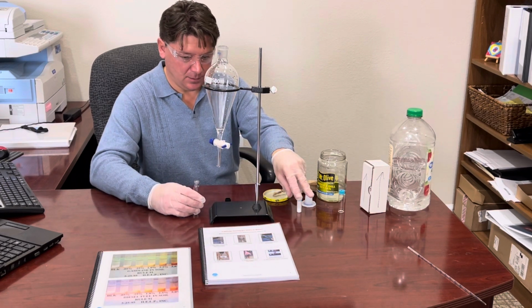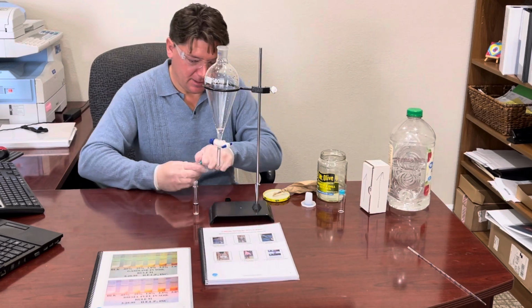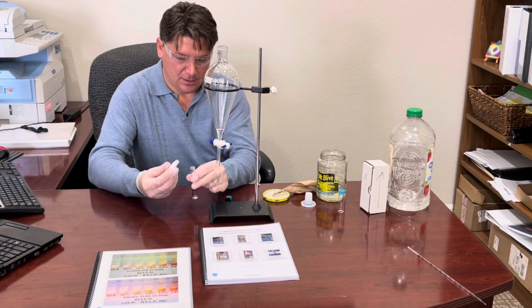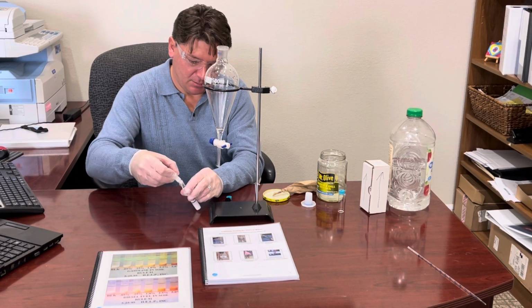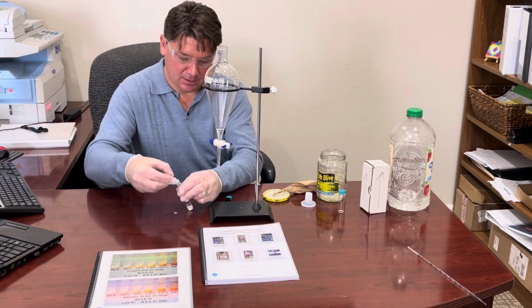Okay, then add our white catalyst powder to our extract to develop the color. And as soon as the white powder hits the extract, it should pop color, because we know that our sample had gasoline in it.